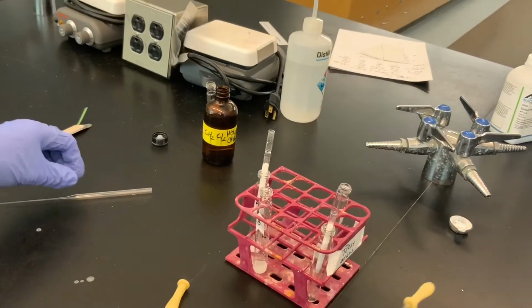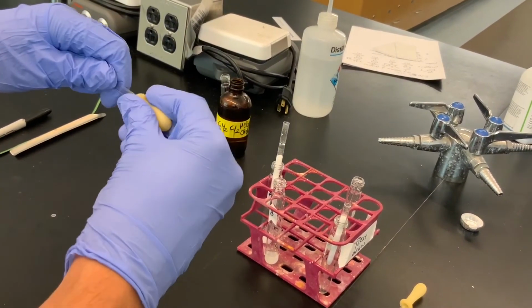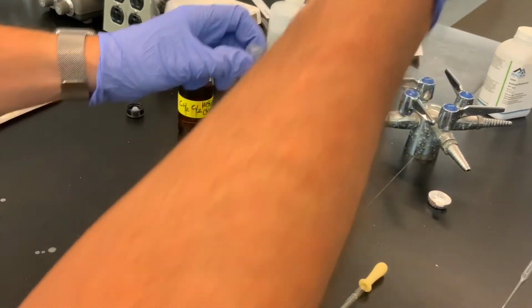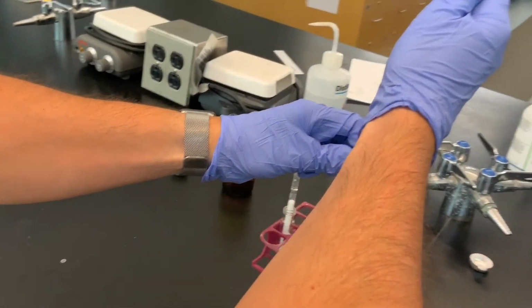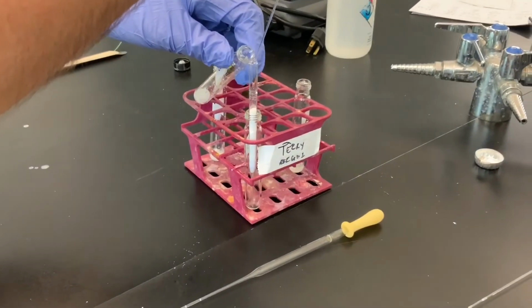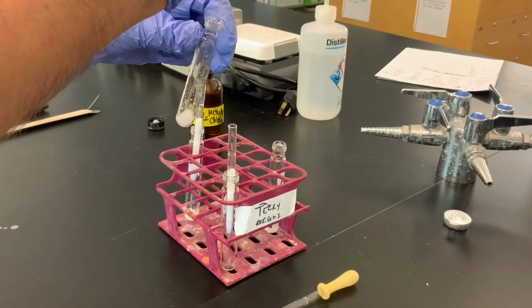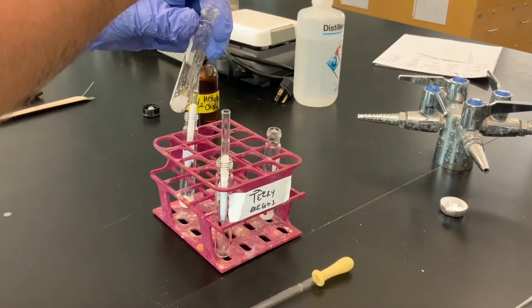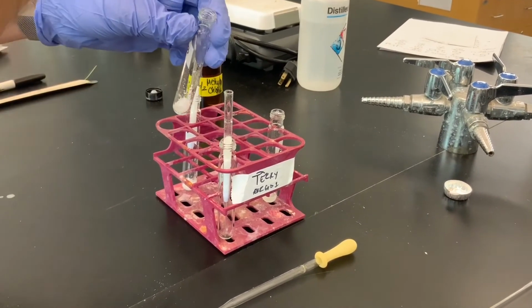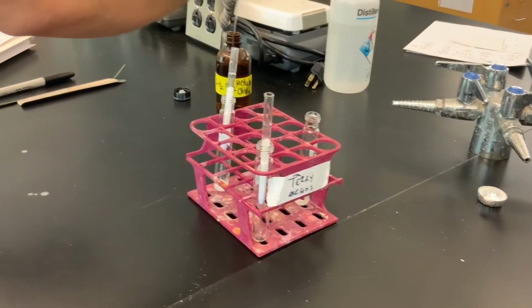So this is my clean pipette for methylene chloride. And now here's a new Pasteur pipette for part B, once again to avoid contamination. And it's going to be the same process. This time I'll do it with them in the test tube rack, because you can do it either way, of course. The first way was faster for me, but more difficult in general.